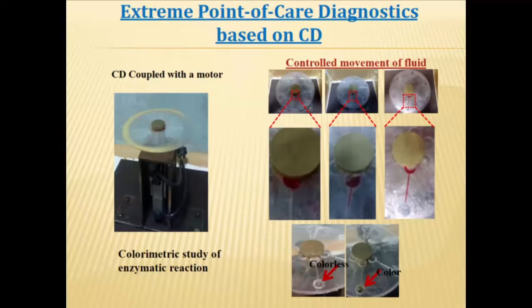This is also established technology. Samsung and other companies are also making a big system again, because they are using optical detection. To use that optical detection, even if it is a small microscope, it requires a huge space and money. So we are thinking of replacing optical detection with electrochemical detection. How can we do that?